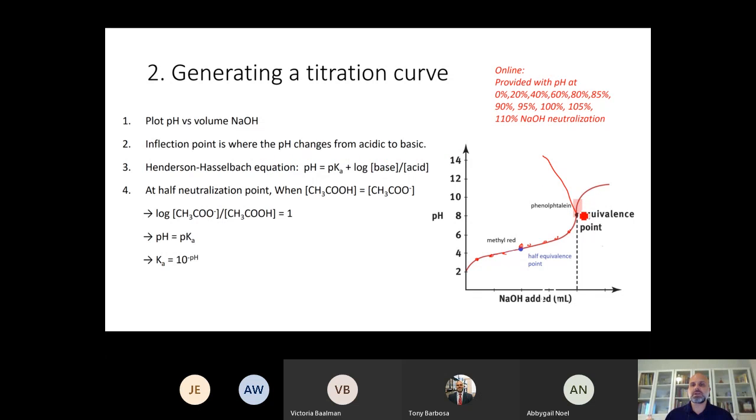So this inflection point, which is right at the equivalence point, is when we are at the point, right? We have our reaction here, CH3COOH is reacting with the sodium hydroxide, right? And as long as we have more acetic acid than sodium hydroxide, let's just say, as an example, we had 0.100 moles of solution here, right? If we have 0.00999 moles of sodium hydroxide, that means in the end we're still going to have an excess of protons on the product side of this equation. So we're going to have extra protons still in solution.